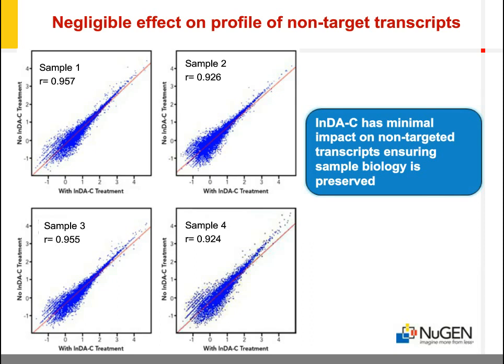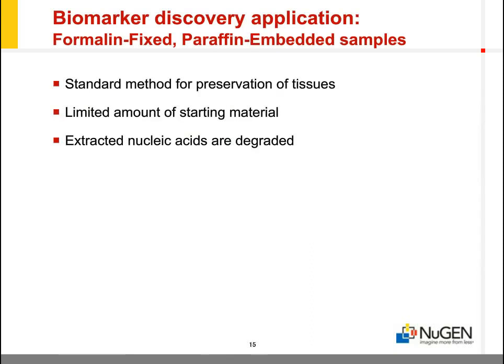Many clinically relevant patient biopsies are formalin-fixed and paraffin-embedded to maintain morphology. Each FFPE block, however, represents a finite resource with a limited amount of material available for study, so methods requiring high inputs cannot easily access these samples. To compound the problem, FFPE preservation was not designed for nucleic acid preservation, and RNA and DNA isolated from these samples are typically degraded.